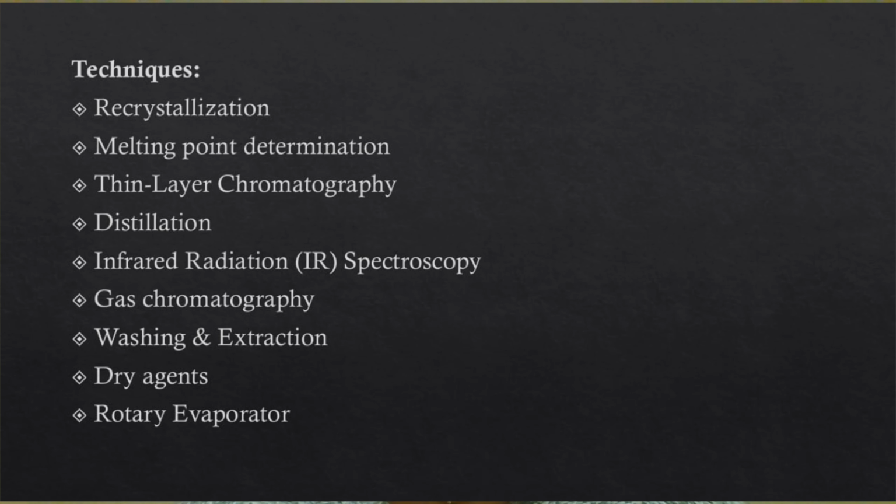Alright, and last but not least, in question number 4, I would like to talk about the techniques we have learned in this course for identifying the characteristics and purifying our compounds. One of the first techniques we have learned in this course is recrystallization. Recrystallization is a technique used for purifying an impure compound using an appropriate solvent.